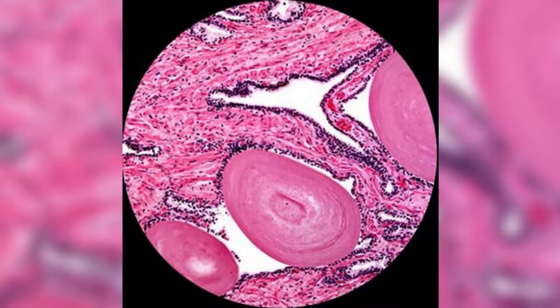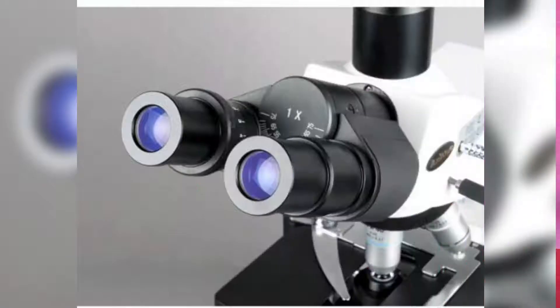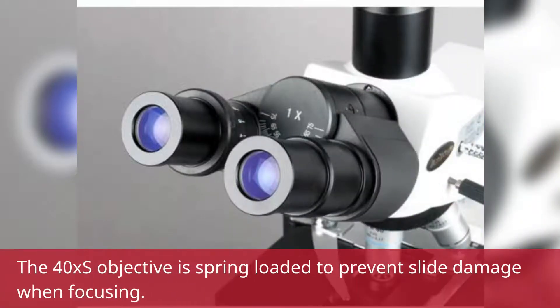The reverse-mounted revolving nose piece has 4x, 10x, 40x, and 100x oil DIN Infinity Plan Achromatic Objectives that provide color correction, focus over the entire range of the viewing field, and a longer working distance for improved focus when auxiliary components are utilized. The 40x objective is spring-loaded to prevent slide damage when focusing.